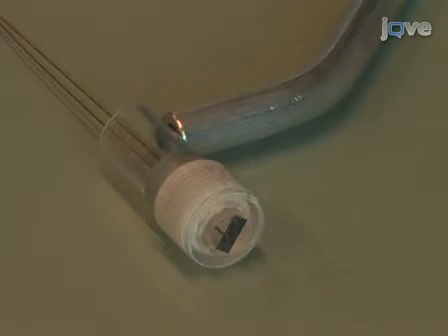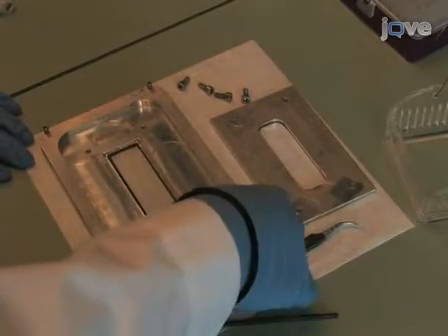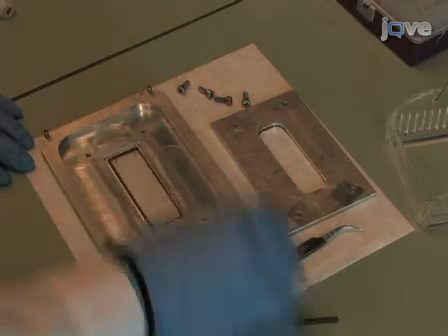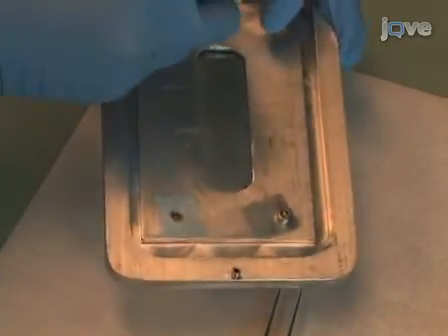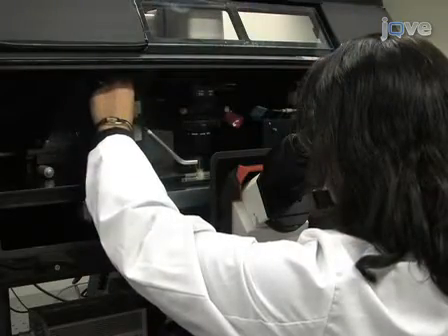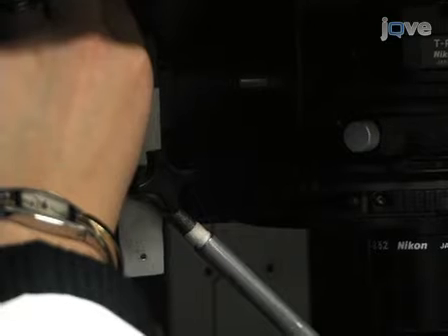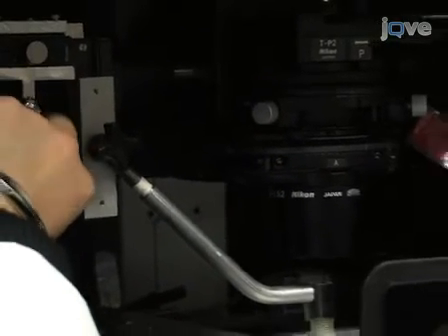With the MFP now assembled, we are ready to begin setting it up. The substrate is inserted into a homemade holder that is affixed in the microscope stage. The gap between the MFP and the substrate is critical for surface patterning processes. Using a three-point support formed by micrometer screws, the horizontal alignment is adjusted with micrometer precision. This is necessary because the substrate is processed by being scanned below the MFP.